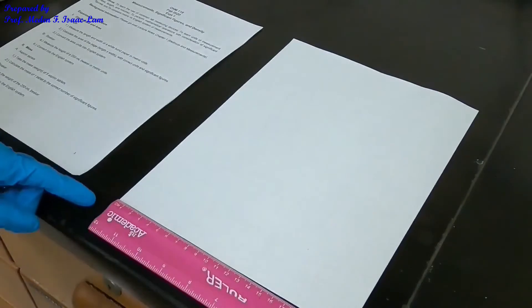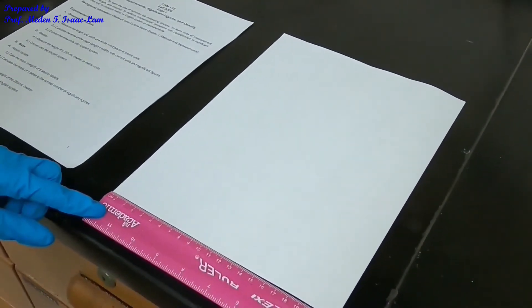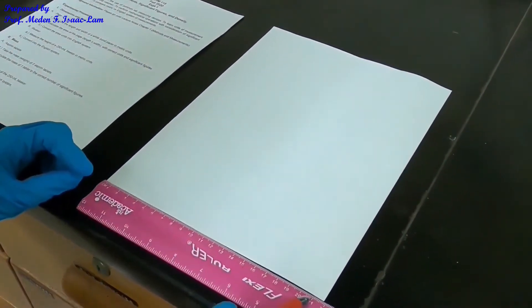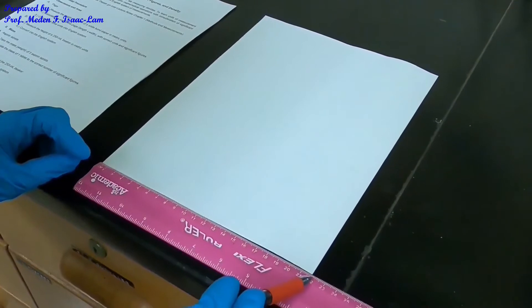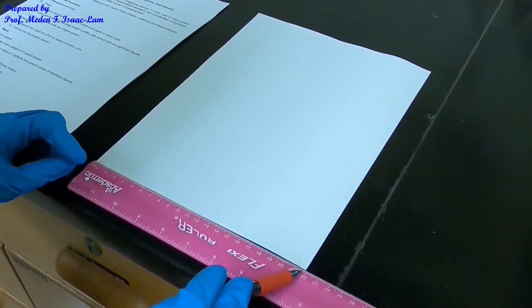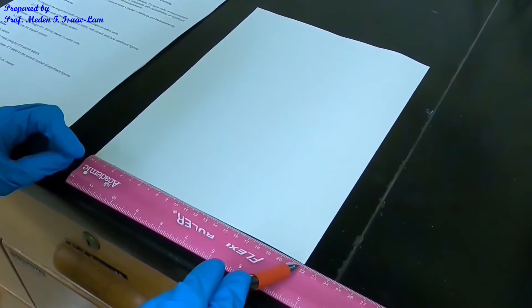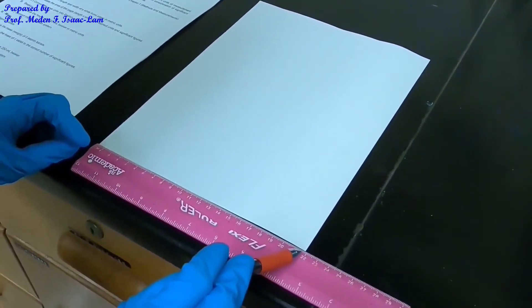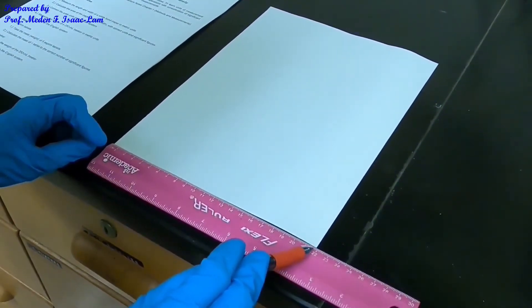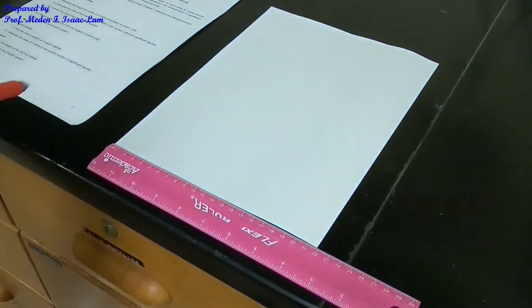I'm going to put the centimeter at the bottom of the page and I'm measuring the width. As you can see, it's in between 21 and 22. So I'm sure of 21, and it reads about 21.71. That's the width of the paper.